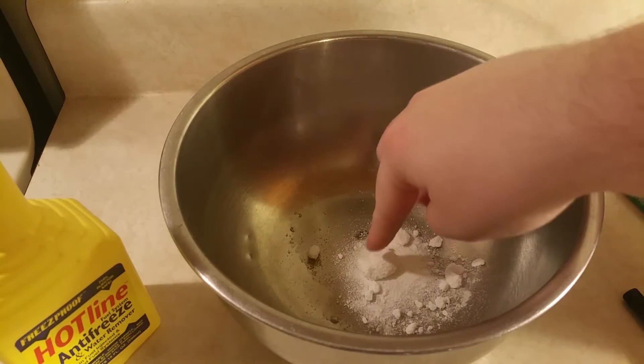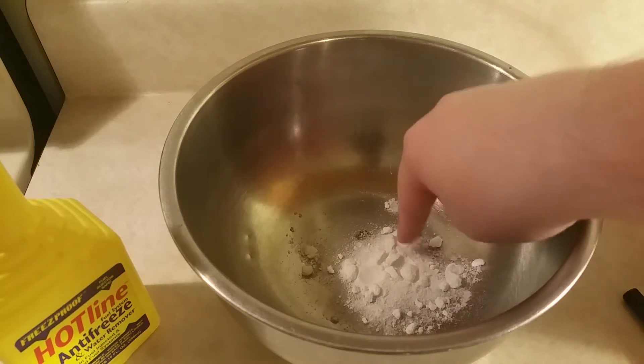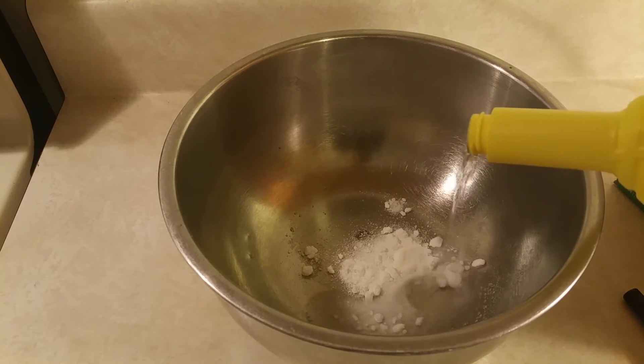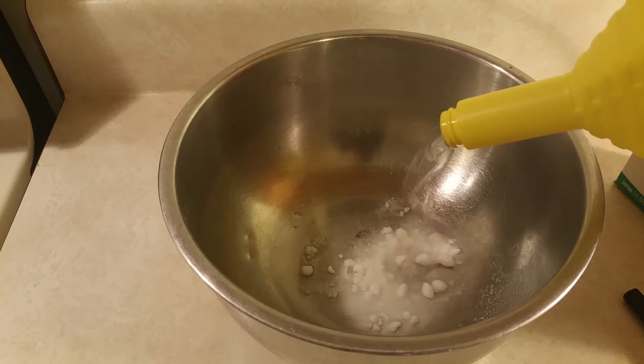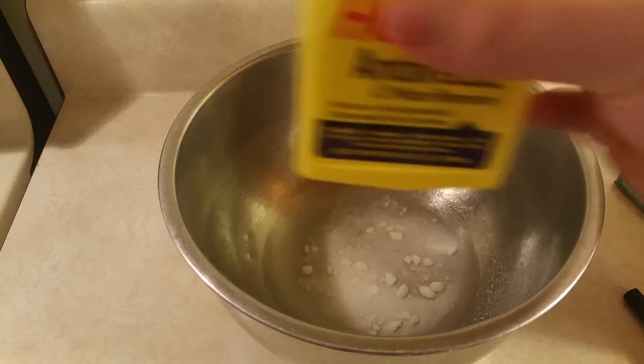Next, you're going to need to add the methanol directly into the bowl to dissolve some of the powder and create tri-methyl borate. The amount of methanol you add is proportional to the amount of tri-methyl borate you make. However, I didn't have a lot and I wanted to do about two or three runs, so I only filled it up just enough to cover the powder.